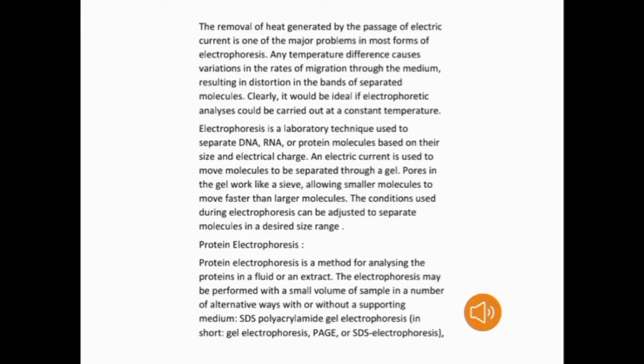Electrophoresis is a laboratory technique used to separate DNA, RNA, or protein molecules based on their size and electric charge. An electric current is used to move molecules to be separated through a gel. Pores in the gel work like a sieve, allowing smaller molecules to move faster than larger ones. The conditions used during electrophoresis can be adjusted to separate molecules in a desired size range.